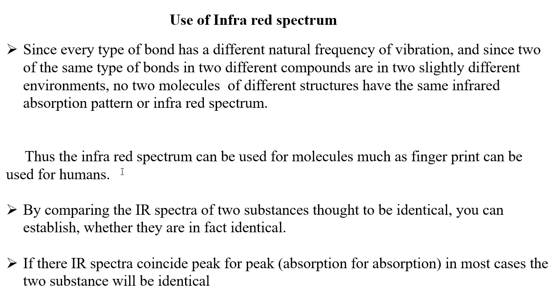Okay, thus the infrared spectrum can be used for molecules much as a fingerprint can be used for humans.